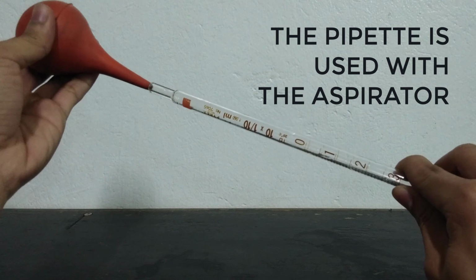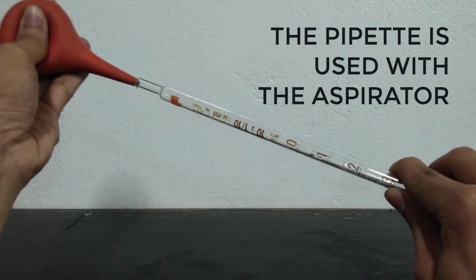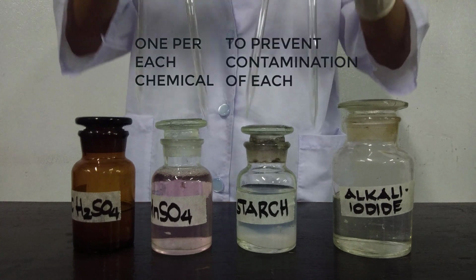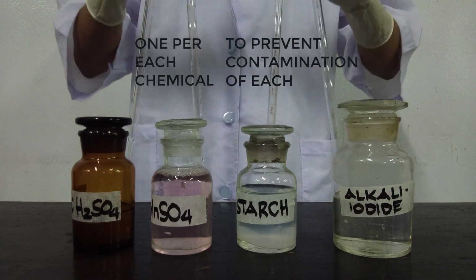We will use aspirators together with pipettes. And for this experiment, we'll need 4 pipettes. We will need 1 pipette for each chemical to prevent contamination.